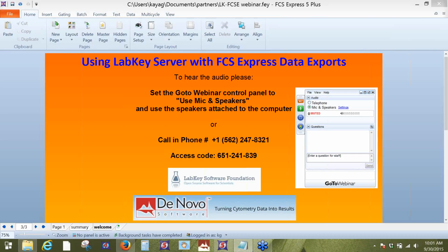So just a little bit about LabKey Server. LabKey is an open source platform for scientific data management and analysis. LabKey focuses on development of tools needed to facilitate biomedical advancement. In that effort, LabKey provides the ability to upload from lots of data sources, including assays, instruments, clinical databases, specimen data, etc., and integrates the information for analysis, visualization, and publication. LabKey provides a rich security and permissions model for securely sharing your lab data with collaborators in a read-only fashion.